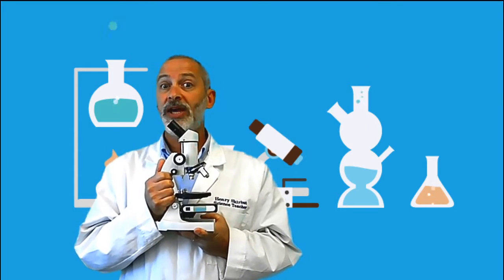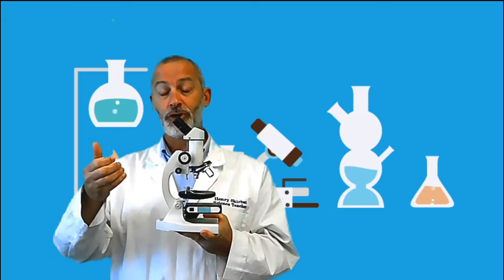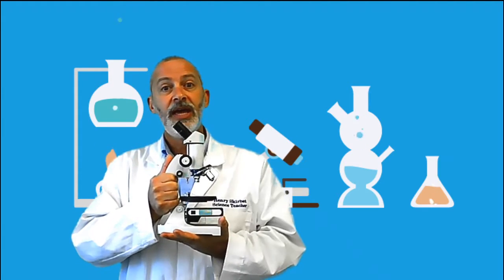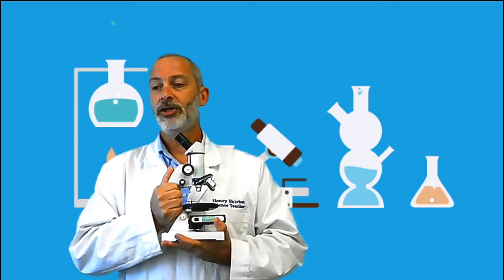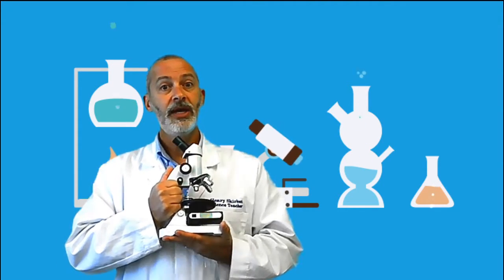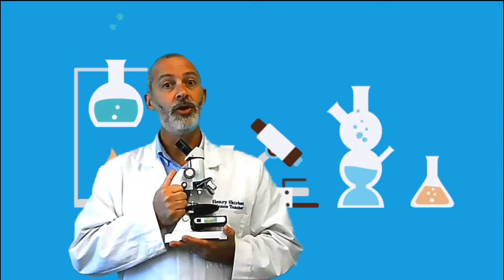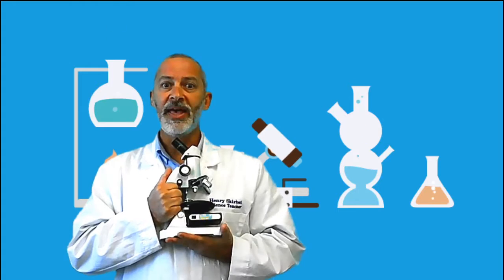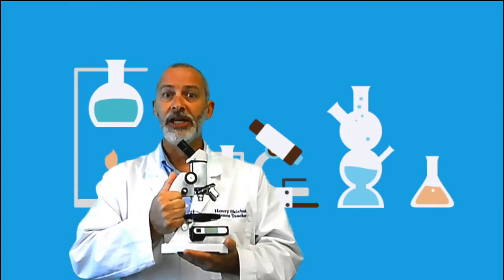So the best way to carry a microscope is to grab it by the arm, hold it under the base, and carry it close. Arm, base, carry it close. Say that with me. Arm, base, carry it close.